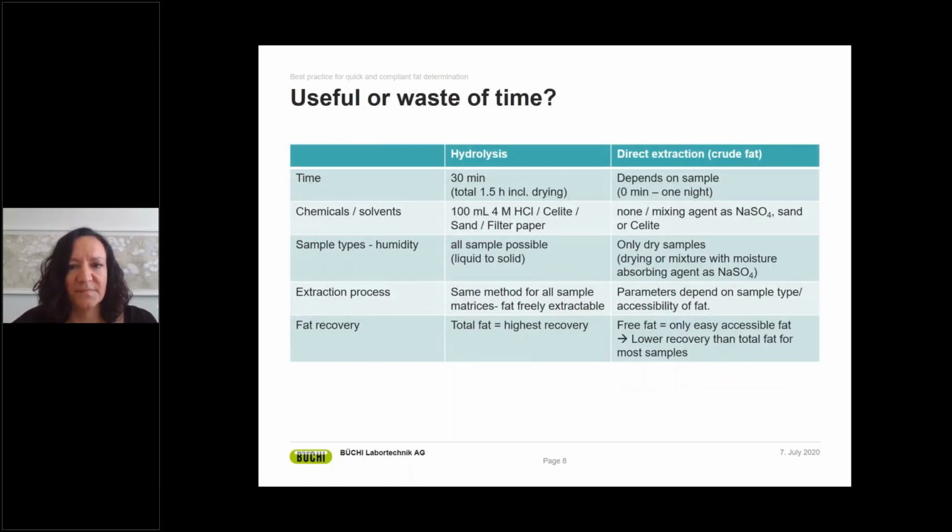With the data on this table, I'd like to discuss a little bit if this hydrolysis step is useful or just a waste of time. We know that many of our customers do the hydrolysis step before the fat extraction, but some laboratories don't do this hydrolysis step. The reasons behind can be different. Either it's not mandatory by the standard methods, or they don't really see the necessity of this hydrolysis step.